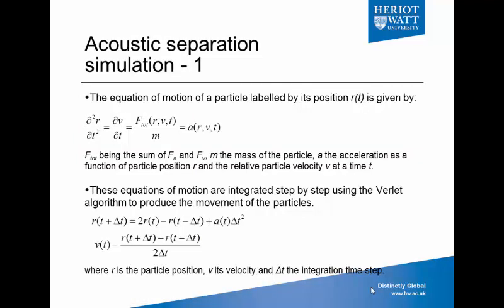To have a hint about how the particles are going to behave in this dynamic acoustic field, we developed a simulation program.